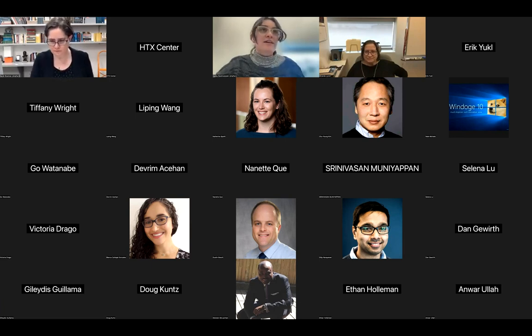I also think things like swapping out buffers at identical pHs can have more of an impact than you think it will. Changing salts, definitely. Recently, I've seen some results of optimization using these broad PEG smears, which is an interesting way to sample a bunch of different PEGs at the same time. So there's a lot that goes into it. Part of it too is thinking, how much protein do I have to work with? Do I have the reagents to be able to set up these optimizations?